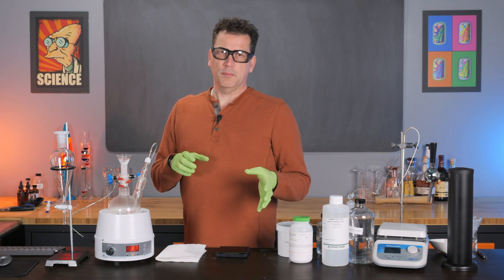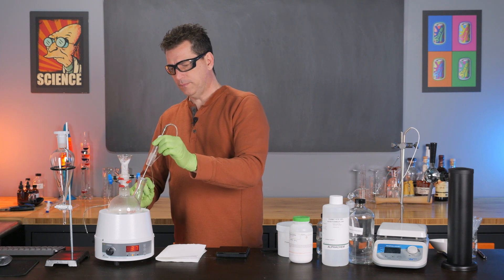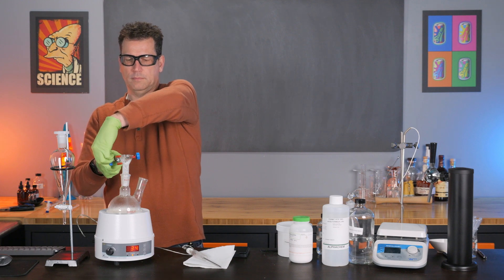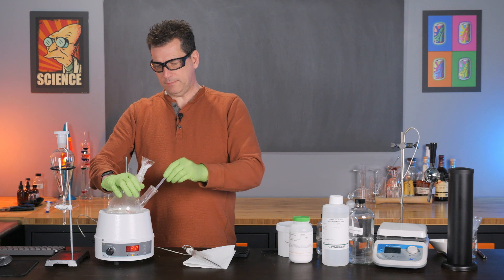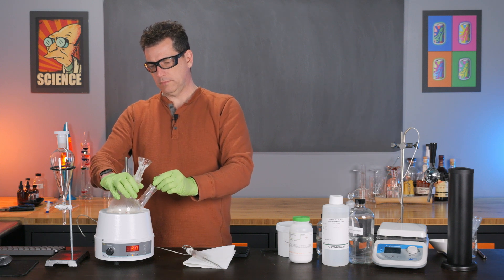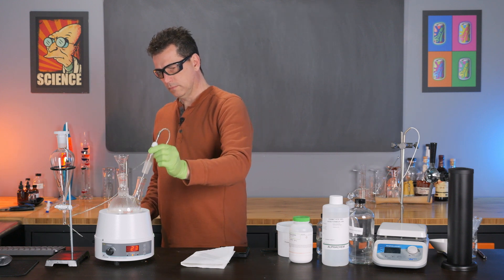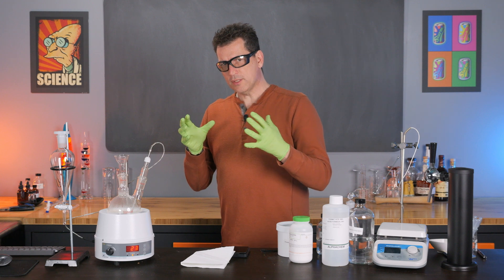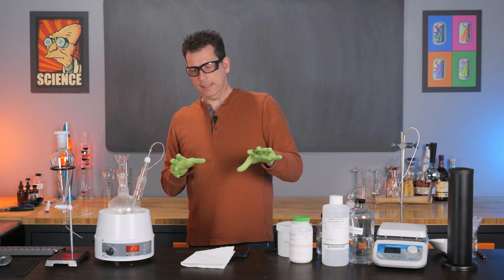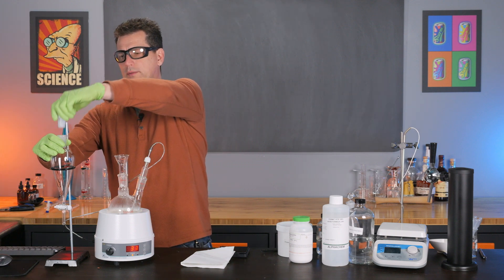I've got all the potassium bicarbonate in. I'll remove the thermocouple, take out the clamp, and use a pipette to wash any residue stuck in the funnel. You can smell the ester in here now — it's not very strong but you can definitely get it from the vapors. Do this in a well-ventilated area and definitely no open flames because this is flammable. Now I'm going to transfer everything to the separatory funnel.